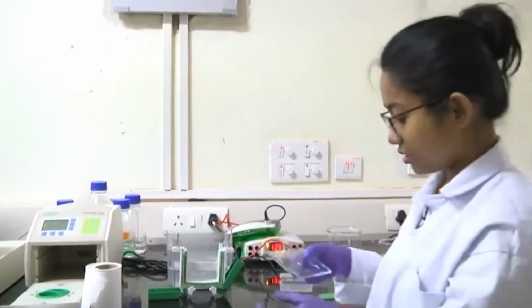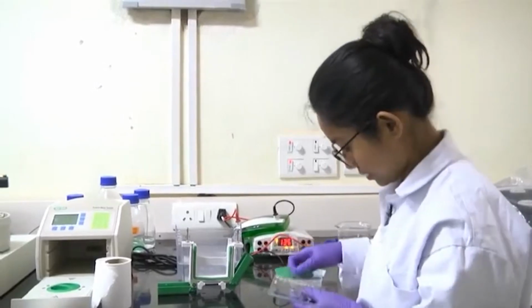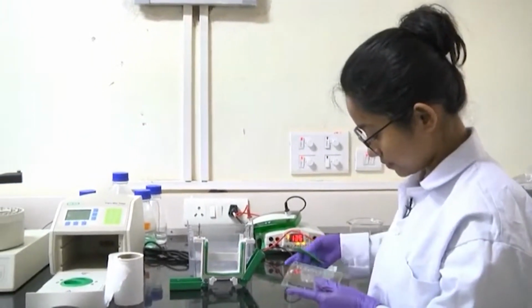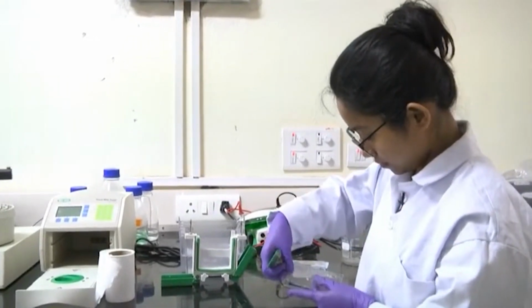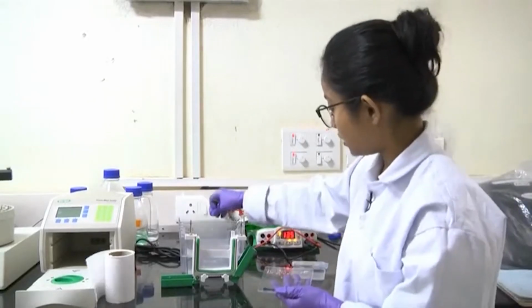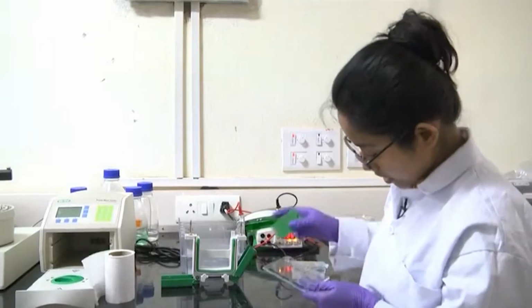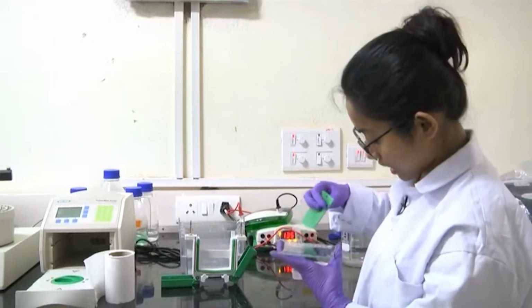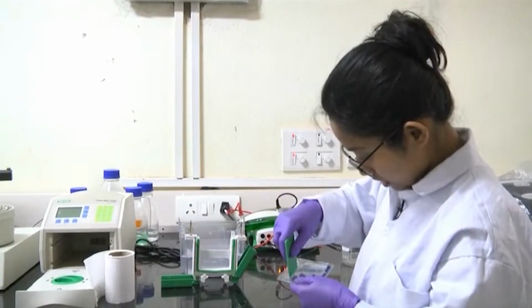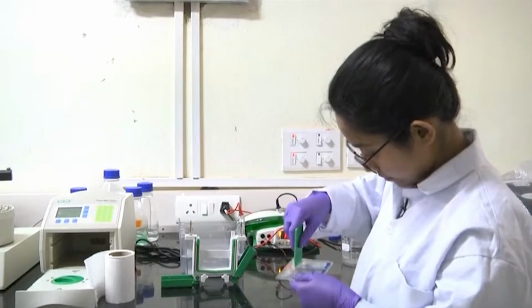So this is the plate which we got. Here the protein is present here. Now I will separate the plate. This is the short plate we have, and we'll keep it here, and the gel is stuck to the bigger one. So now I will just cut my gel according to the size I want. First I will remove the top, the stacking gel basically.